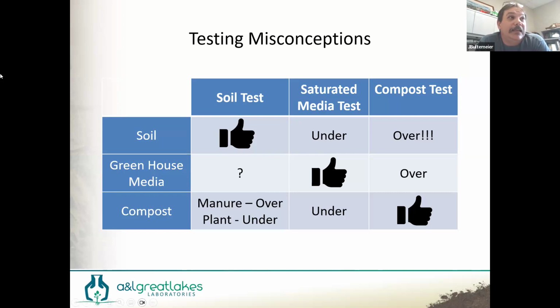If I do a saturated media test on the soil, I'm going to miss all of the things on the cation exchange capacity, the mineral that's going to dissolve in the next year or two. I miss all of that. I only get what's in the water-soluble fraction.